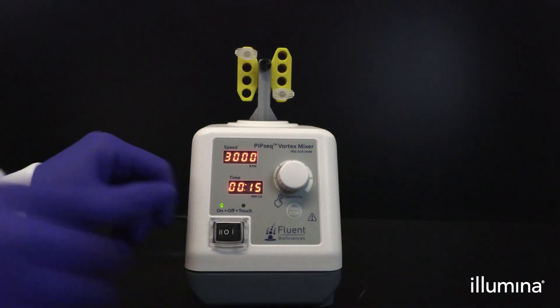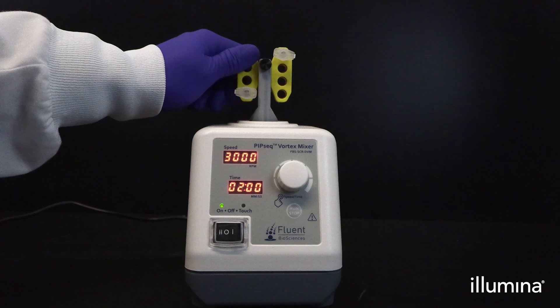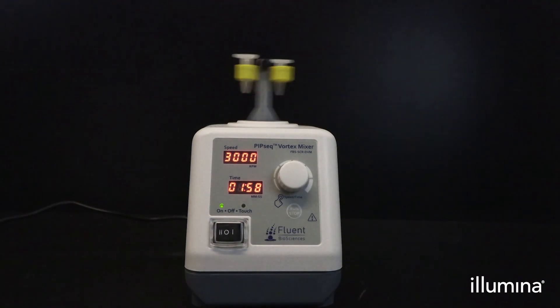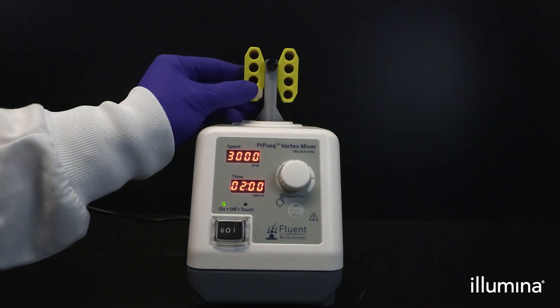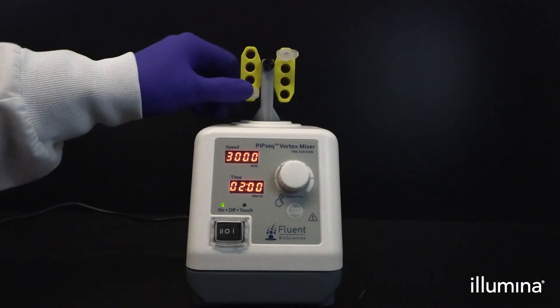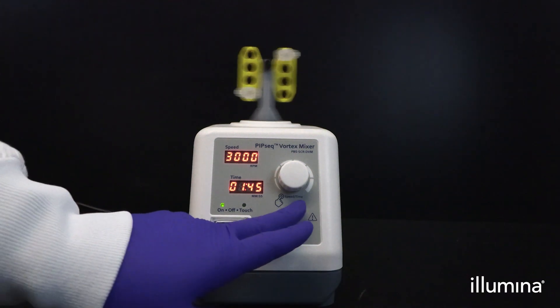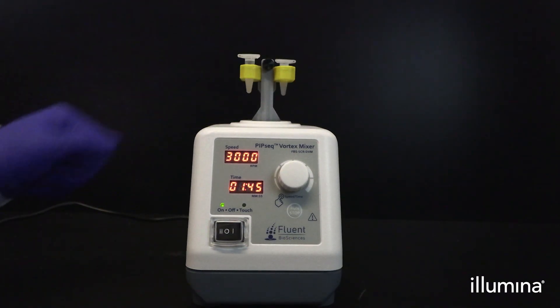Samples will be vortexed for 15 seconds in the horizontal configuration, followed by 2 minutes in the vertical configuration at 3000 RPM. For better vortexing efficiency, we recommend starting the timer at 2 minutes and stopping the vortex with 1 minute and 45 seconds remaining, or after 15 seconds of vortexing horizontally. Rotate the vortex head into vertical configuration and hit the start button to vortex vertically for 2 minutes.